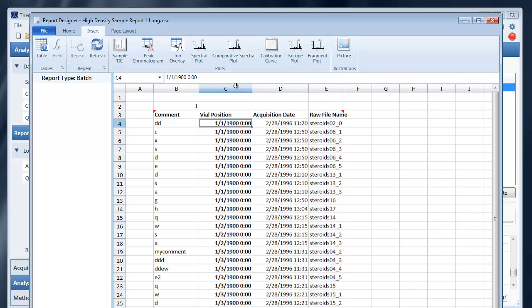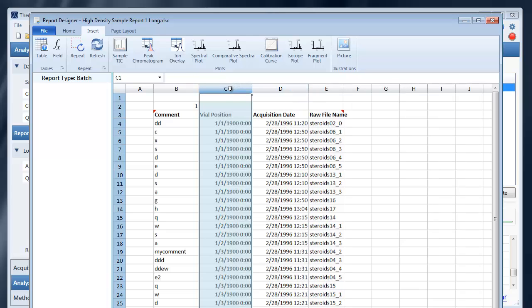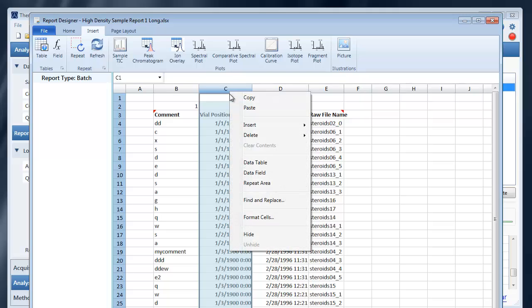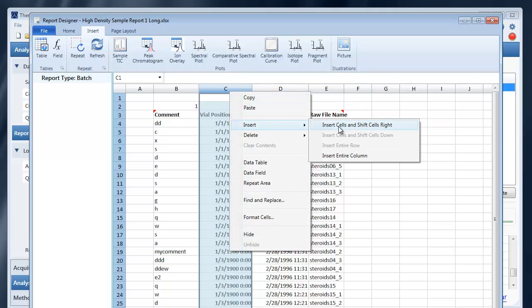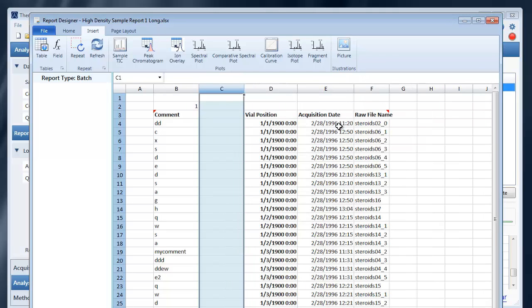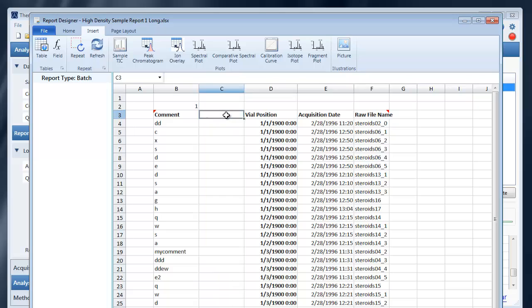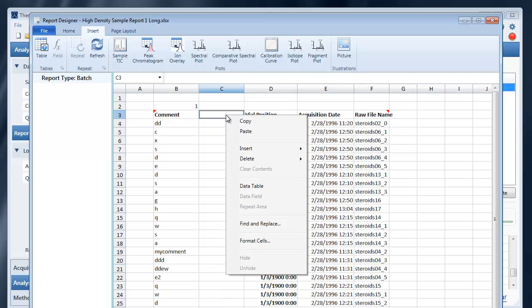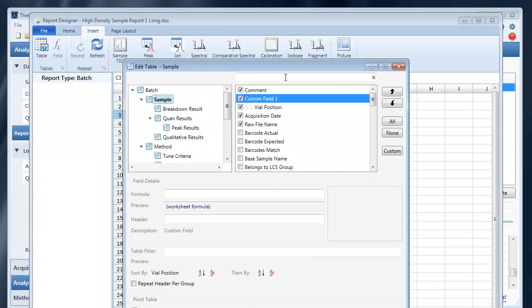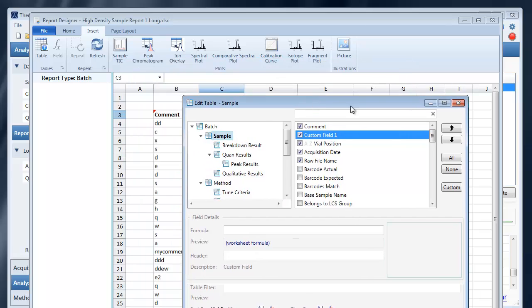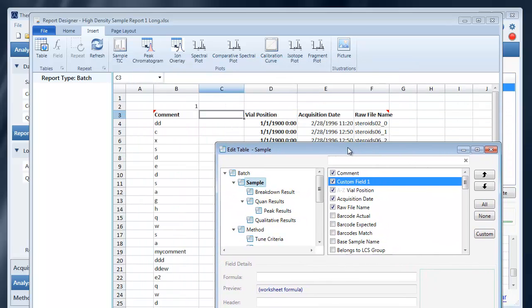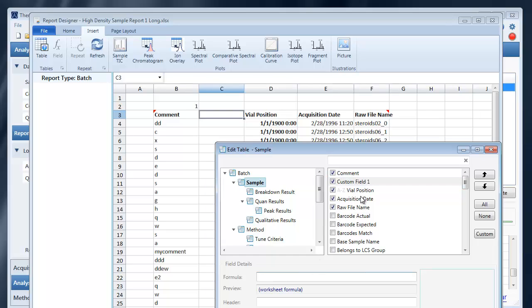One way you can get around that is by inserting a new column in this way. This will add a new custom field, blank custom field, in your table. And you'll notice that the vial position was shifted down along with its formatting by using the insert.